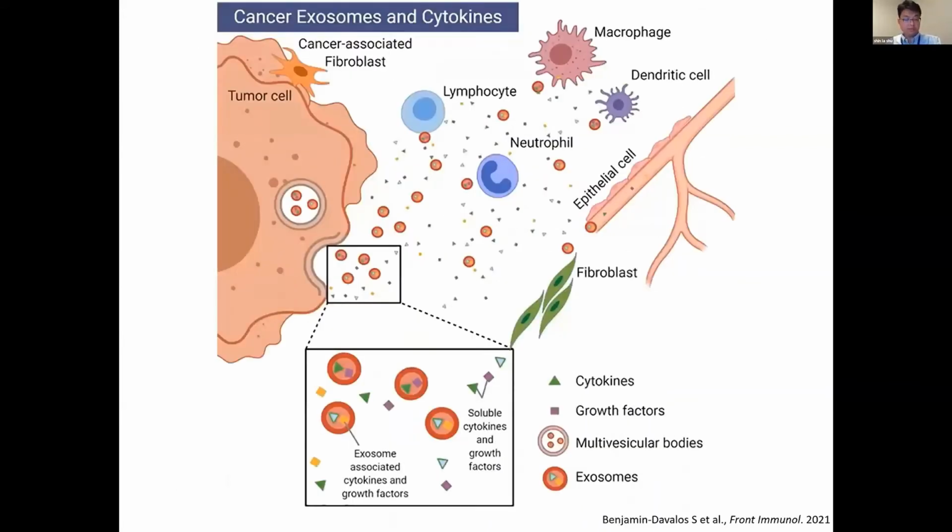So let's zoom out of the picture and see where we are in terms of cytokines in relation to exosomes. Currently, I have only investigated what happens if you reduce cytokines that are co-isolated or concentrated with exosomes, but I did not examine cytokines within exosomes. I do not contest the studies of my colleagues that when you lyse exosomes, the cytokines are released and this increase is measurable. I'm only suggesting that it may be possible for cytokines to be co-eluted into exosome isolation. So this possibility should be factored into experimental planning, both upstream and downstream.